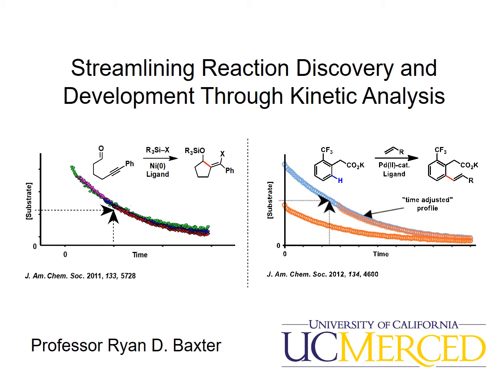So both of these projects involve inline measurements using ReactIR of full reaction progressions. These are both sets of real data shown here on the title slide, but the kinetic methodology to do one versus the other is very different. And so I'll give you a flavor for each one, and you can tell that I'm biased in one of these, but you can decide for yourself which one you'd like to do.